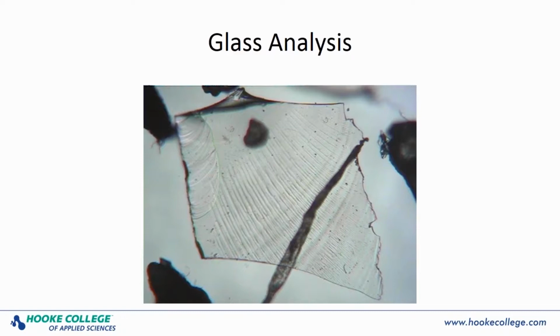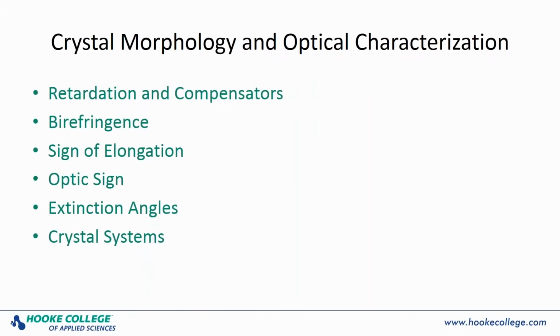There are many particles that look like glass, such as quartz, the mineral, other minerals, fragments of hard plastic, pieces of hard candy, etc. But these can easily be differentiated by examining their optical properties. Most particles have more than one refractive index.